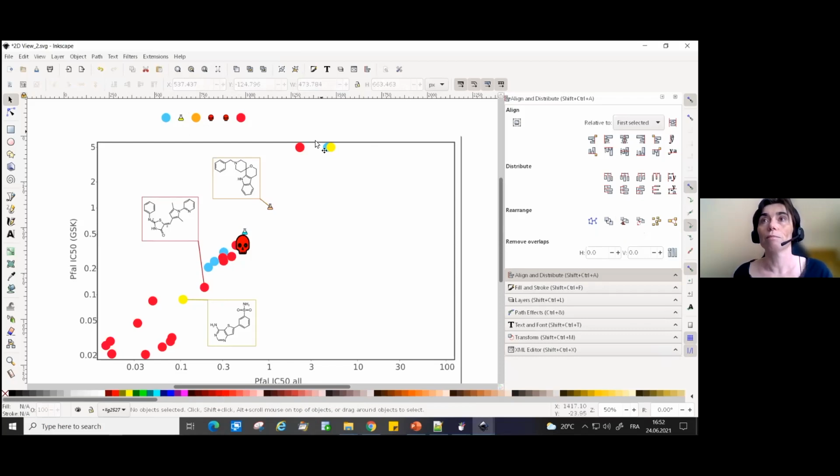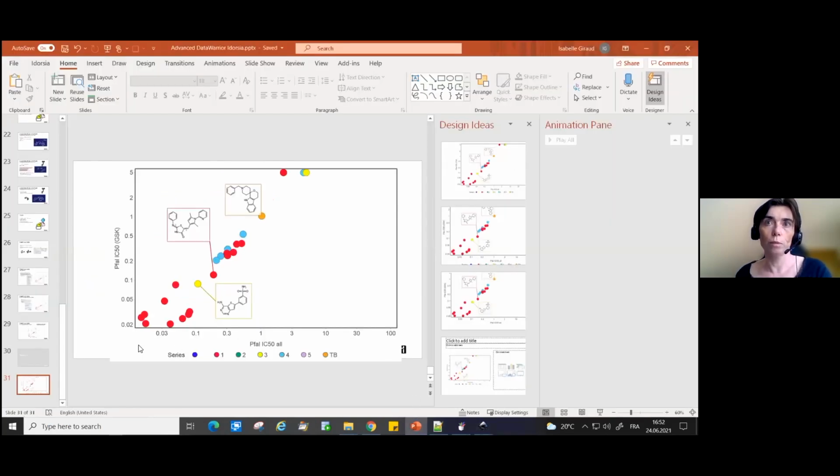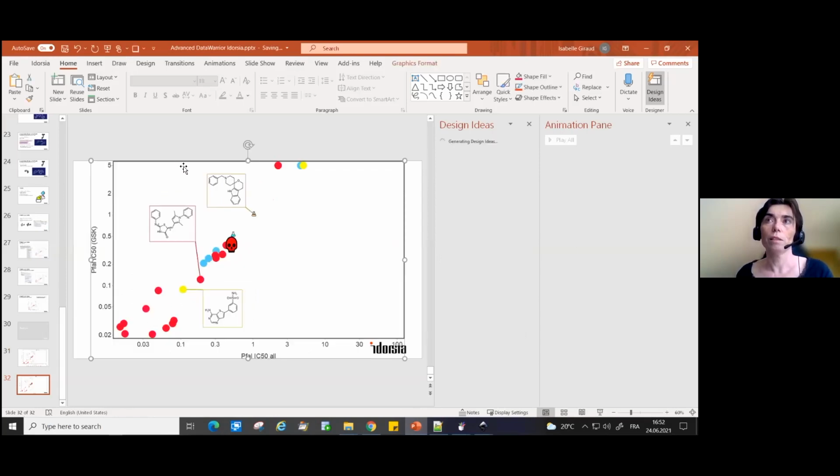And you can do that for them. Okay, so this is really just aesthetic, but sometimes it's very useful to convince people. So I thought I would show you that because I'm such a fan of this game. I saved the file, and of course you can delete what's not useful. And now again you can copy that, select everything, make a Ctrl+C, and go into PowerPoint and paste it.